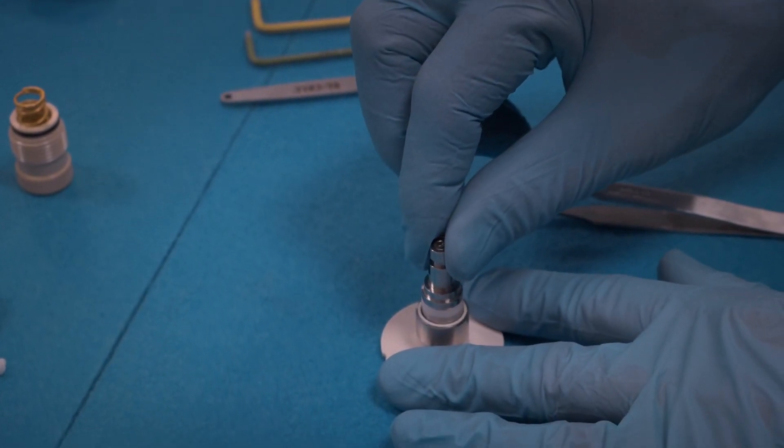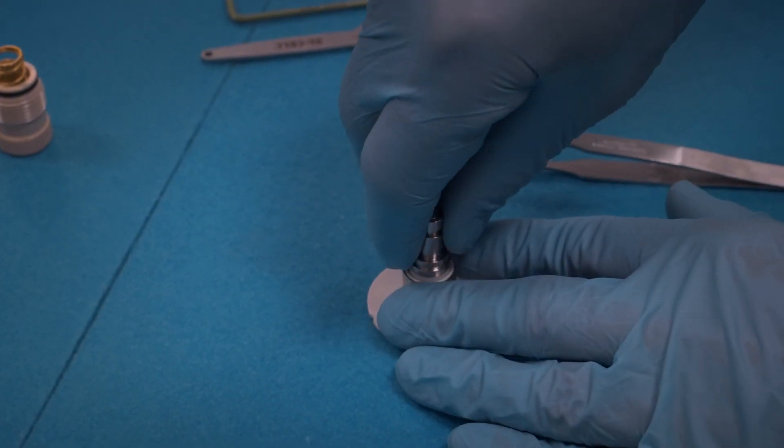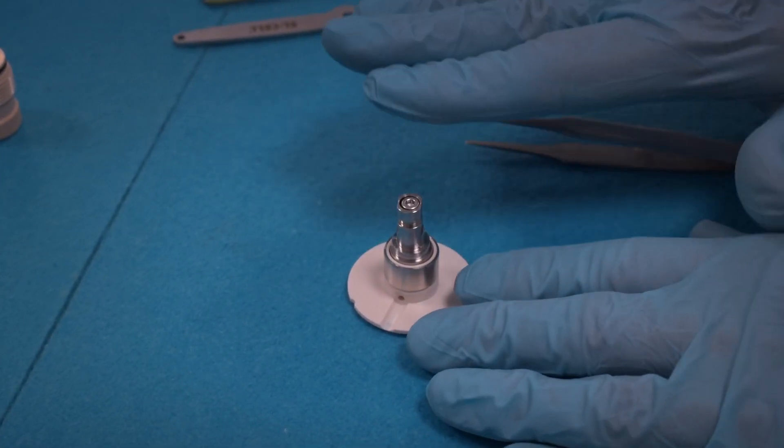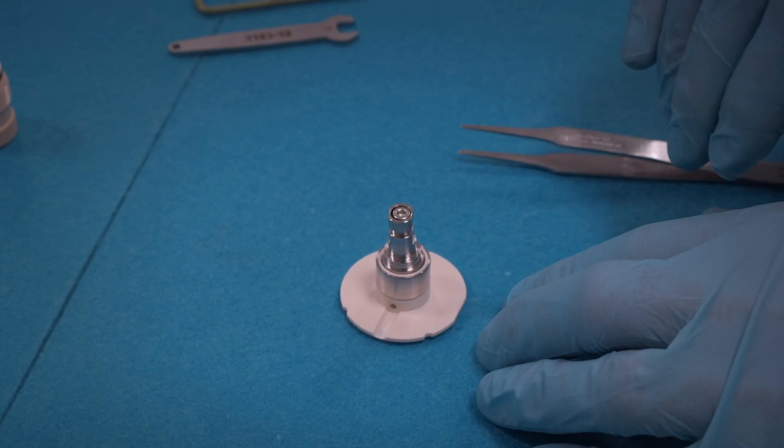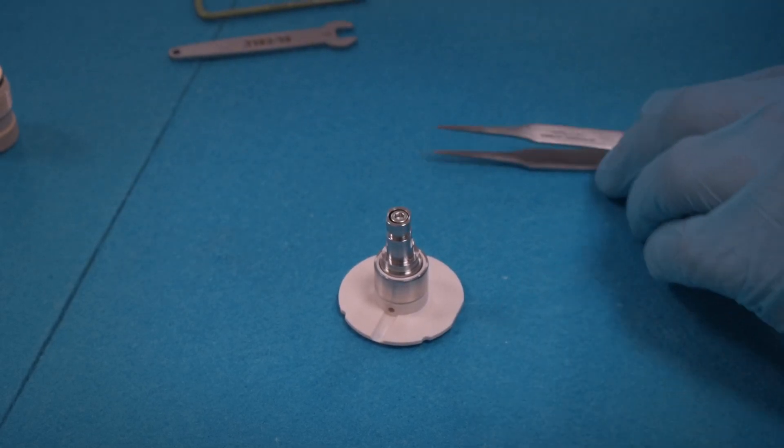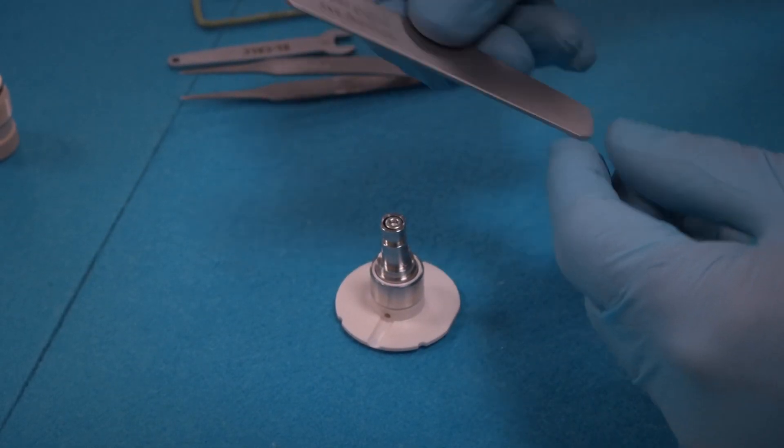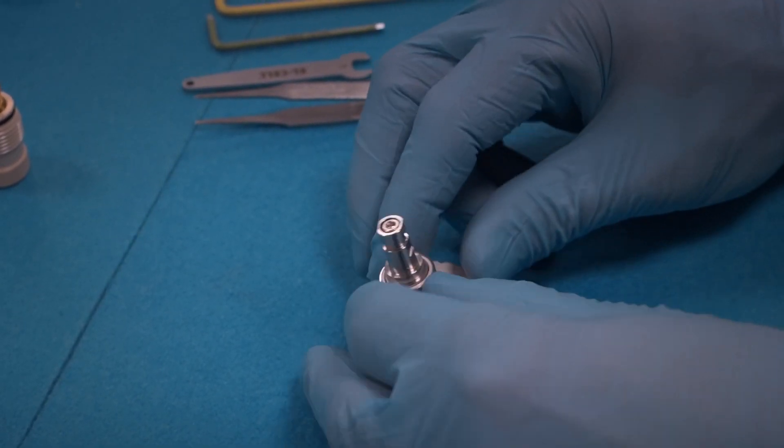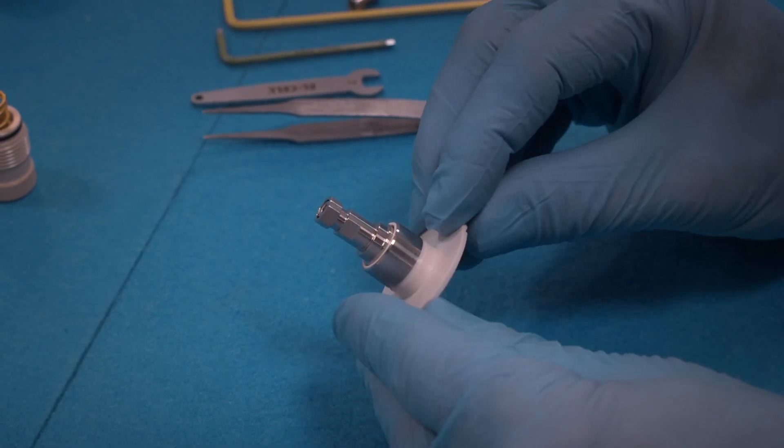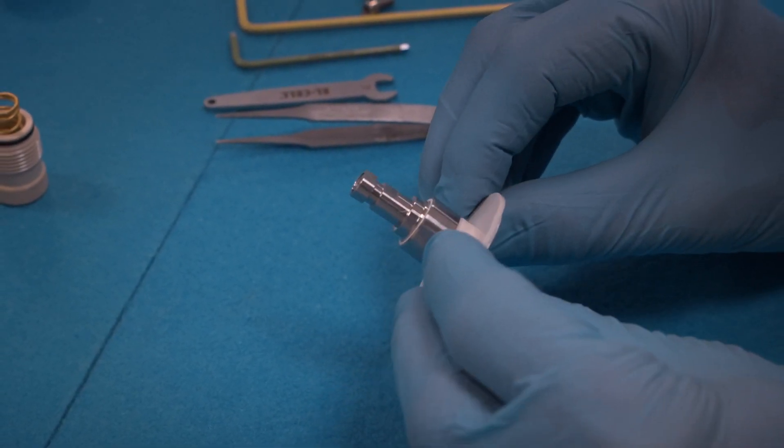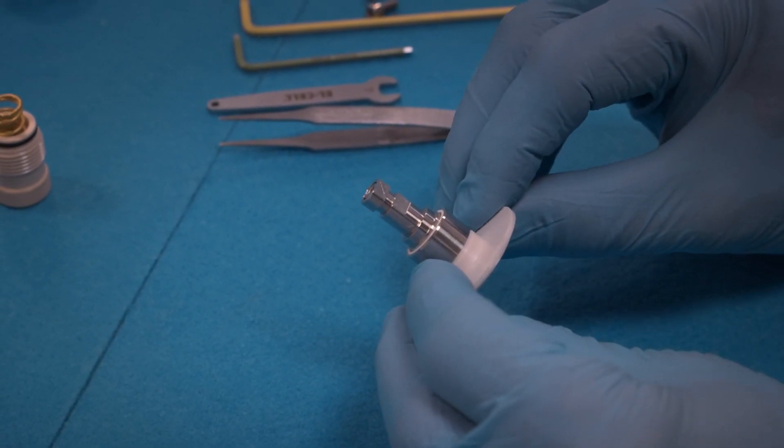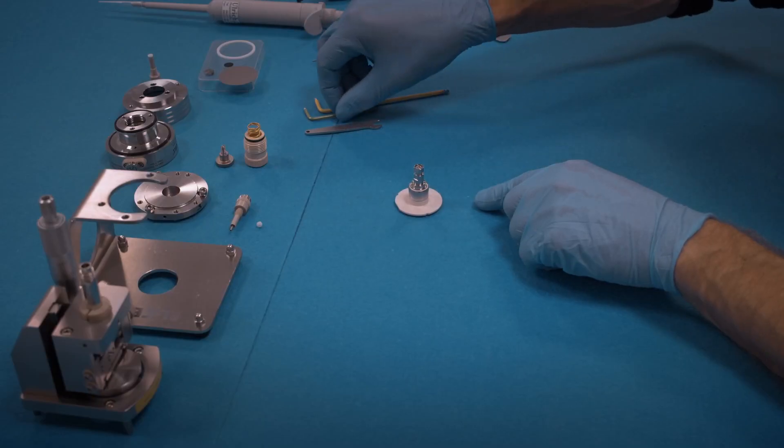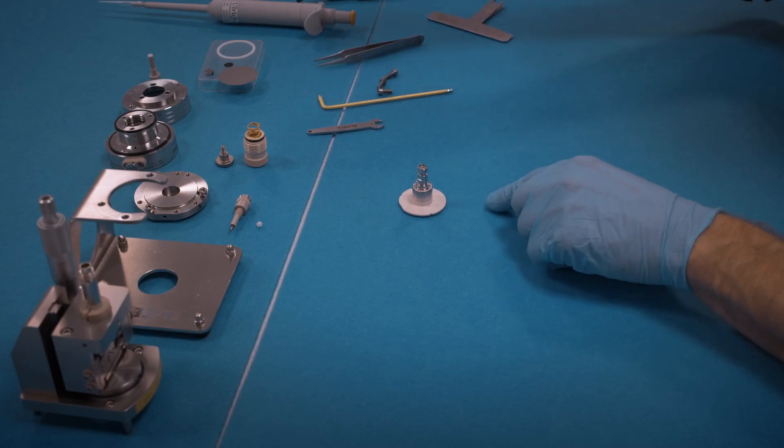Insert the piston into the frit flange. You have to apply significant force to bring the piston down. We recommend using this helping tool to press onto the piston. Make sure that the seals are no longer seen so that the piston is really down, and only then tighten the center screw.